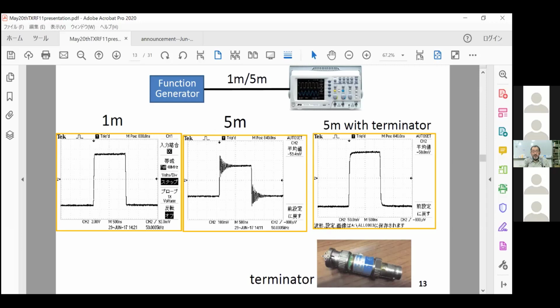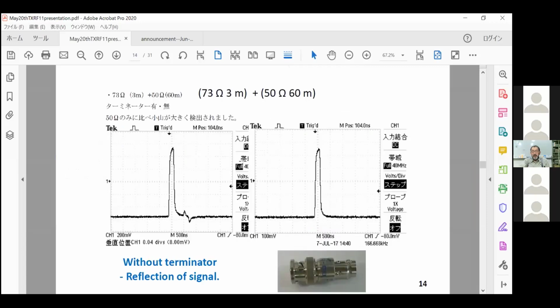But before that, we must repair the wrong place. Maybe the electric conductivity is different, or the impedance was not regular. This is another example for different cables and different ringing.